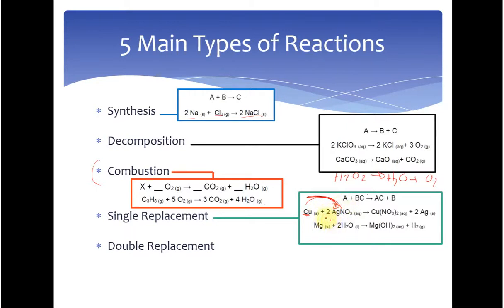The fact that you are forming a solid does not mean that this is a precipitate. It just means it is a single replacement reaction. We'll talk about precipitation in a minute. You guys also witnessed single replacement when you added magnesium or calcium to water and you produced calcium hydroxide or magnesium hydroxide and hydrogen gas. Again, gas forming is a pretty common sign of a chemical reaction.